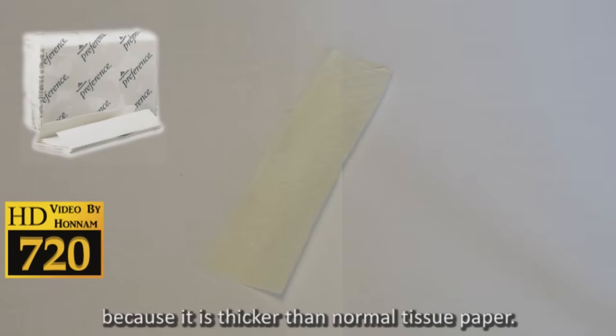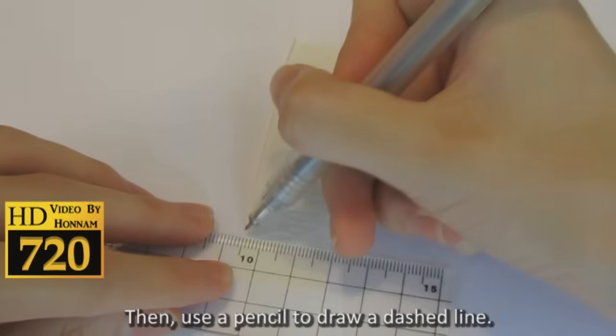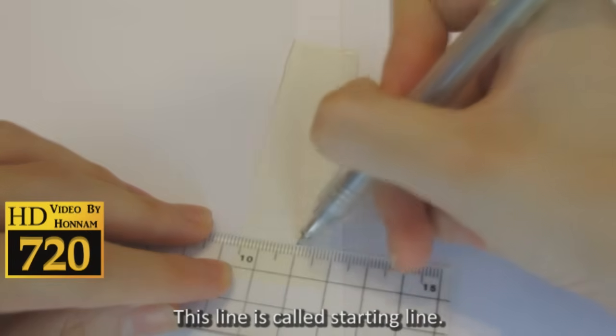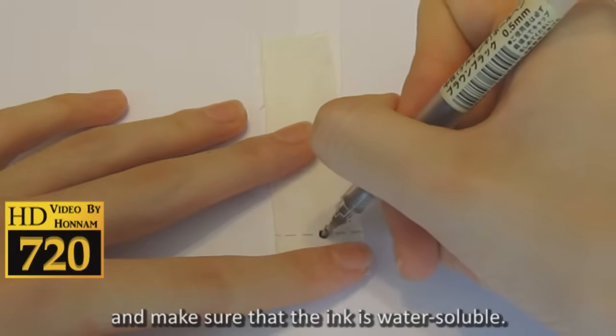Then use a pencil to draw a dash line. This line is called the starting line. Draw a dot with your pen on the starting line and make sure that the ink is water soluble.